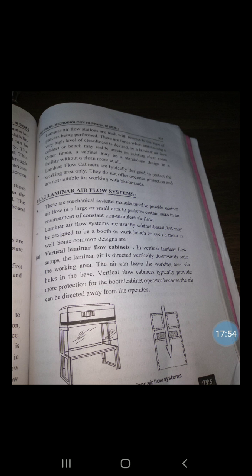Here we can see the vertical laminar airflow system. In the vertical laminar airflow setup, the laminar air is directed vertically downwards onto the working area.